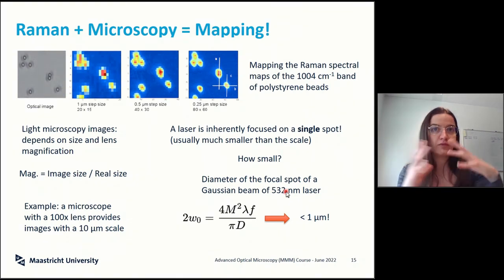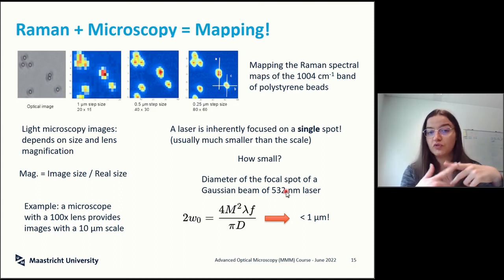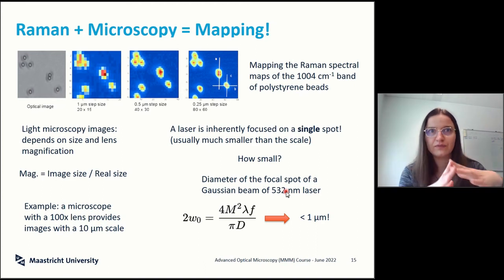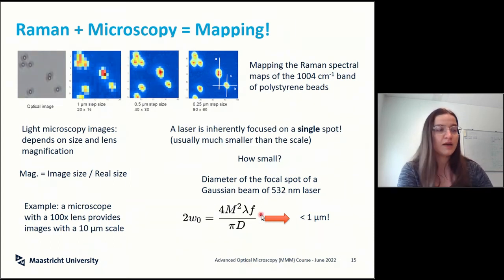So when you do Raman, when you do the imaging, you need to keep track of the position you are at, because to be able to use the laser, you need to stay at a different magnification, a magnification that will allow you to focus the laser beam. With a 5x objective, you are able to see the image. It's perfectly fine for broad visible light, but the laser will not go into focus. These lenses are too big, so you need an objective that allows for this trick of focusing the beam. That said, that can be done because if you are able to track the position, it's feasible.